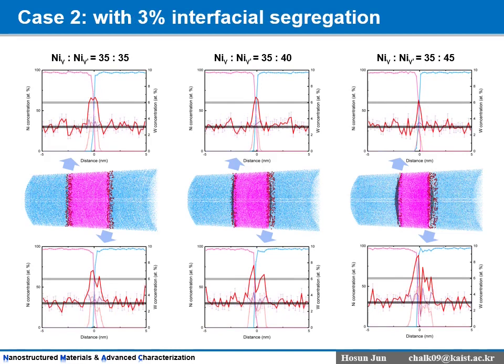And these are the results from the tips with interfacial segregation. Similar to the previous result, the interface bends more when the field difference gets larger. In the upper interface, the interfacial tungsten concentration peak slightly gets lower and becomes narrower as the field difference gets larger. And at the lower interface, the artifact is more dramatic, showing a clear increase of peaks as the field difference gets larger.